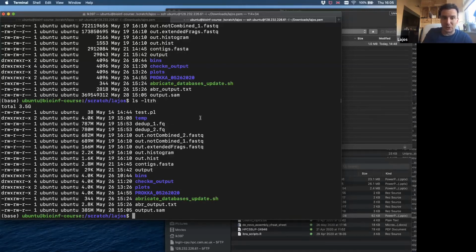Yeah, so while it is running, I can speak to you about BWA. I don't know if we will use BWA today, maybe not. When I did my very first whole genome realignment, I used BWA, and somehow the eukaryotic whole genome realignment pipelines suggest using BWA and not bowtie.